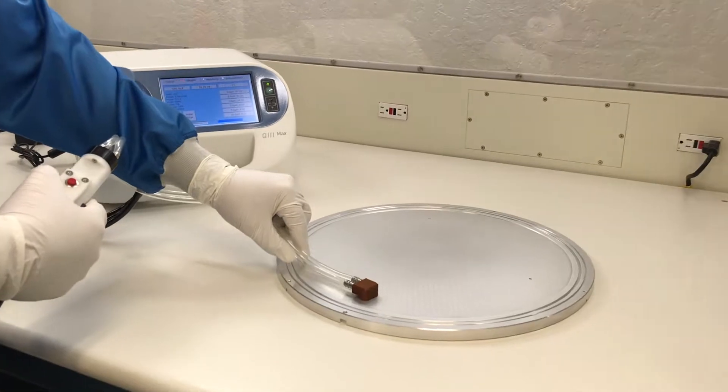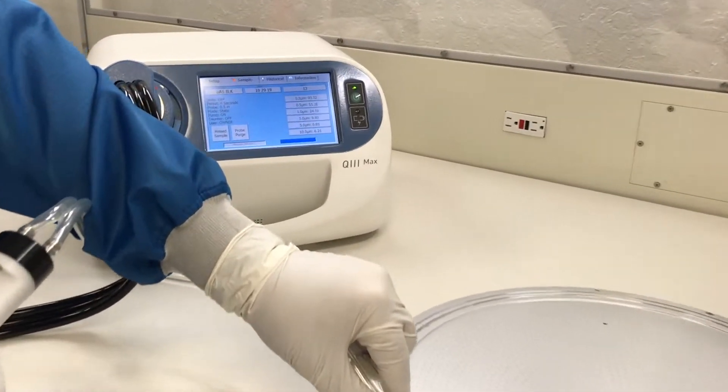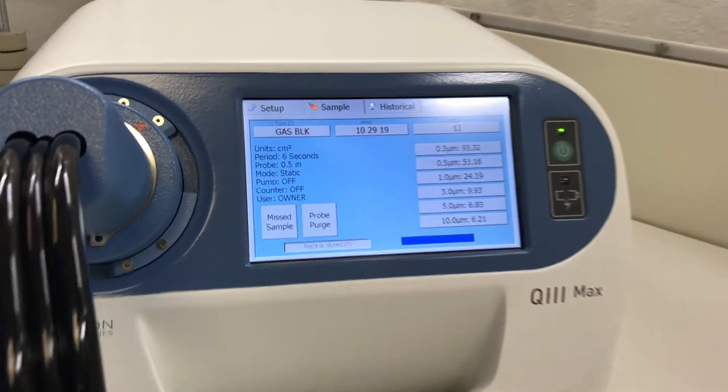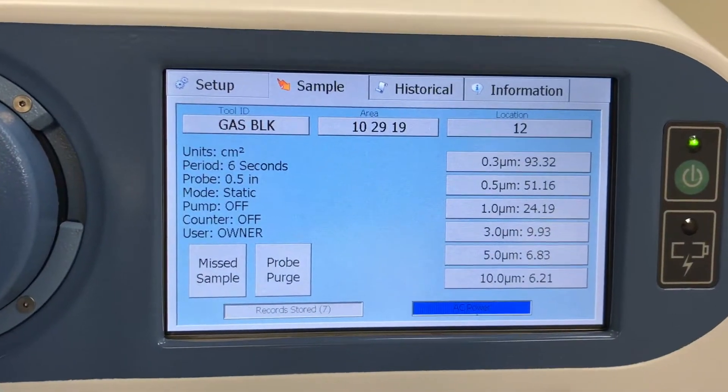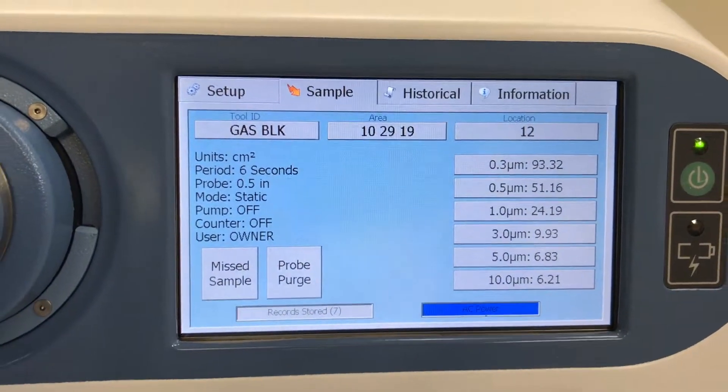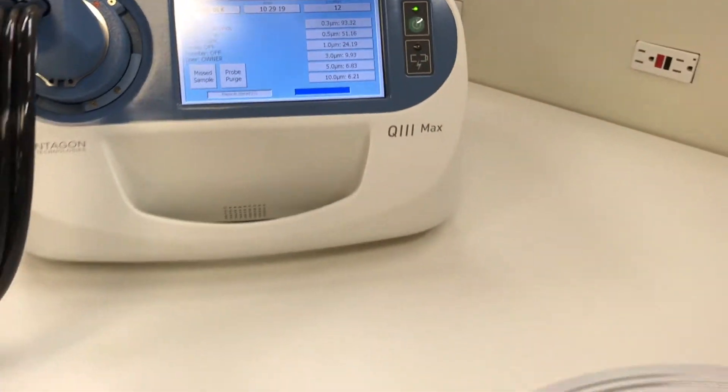The test takes six seconds. The results show that 93.32 particles greater than 0.3 microns per centimeter squared were detected in six seconds.